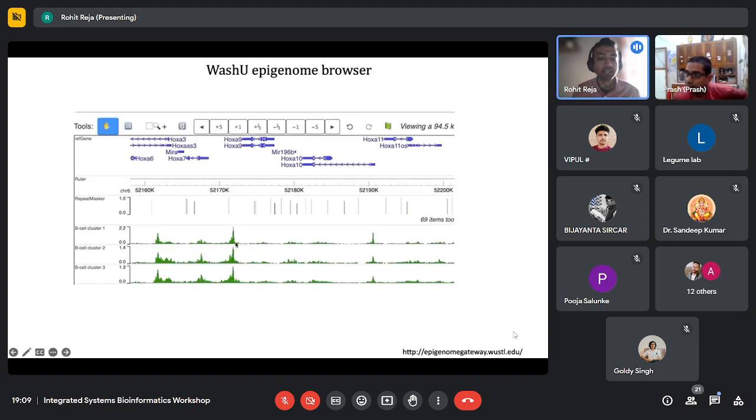That's a great question, Prash. So look at the intensity, basically the signal, the amount of reads. For ChIP-seq, you're looking at the amount of reads in this particular region, and that's basically your signal strength. The more reads there are, the stronger the binding of the transcription factor to that DNA region, you can imagine. The basic concept behind it is that a transcription factor binds to DNA, and they're always binding and coming off the DNA. That's how they interact.